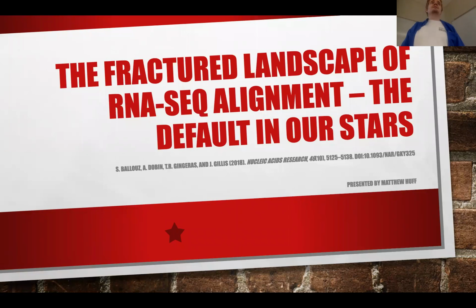So today I'm going to be giving a brief overview of a paper called The Fractured Landscape of RNA-seq Alignment: The Default in Our Stars. This is going to be a very brief overview. This is a chunky paper with a lot of crazy figures. It really goes into depth on how each of these alignment tools work, like the normalization methods they used. I'm just going to give a brief overview of some of the findings in terms of how these RNA-seq alignment tools work.